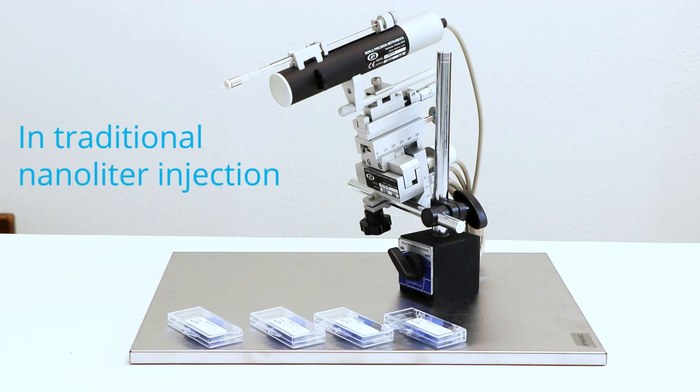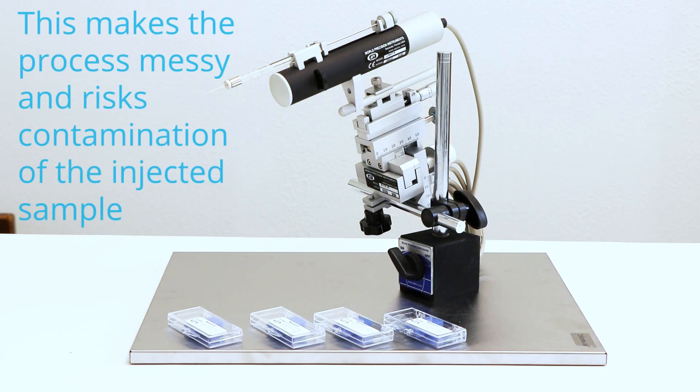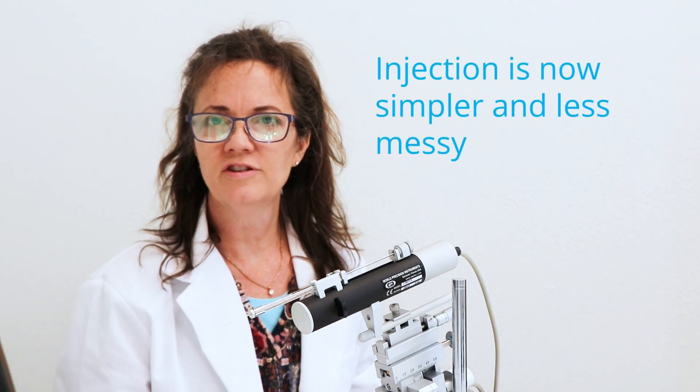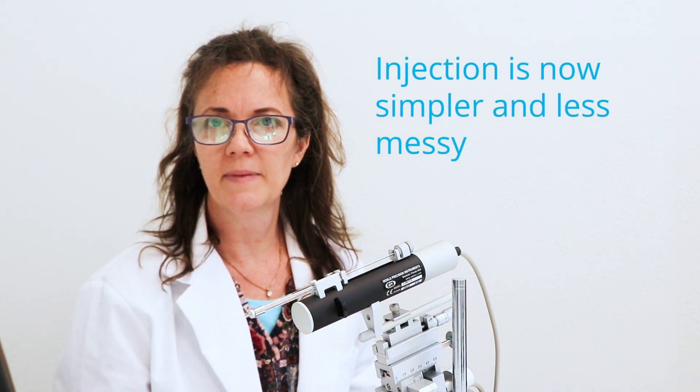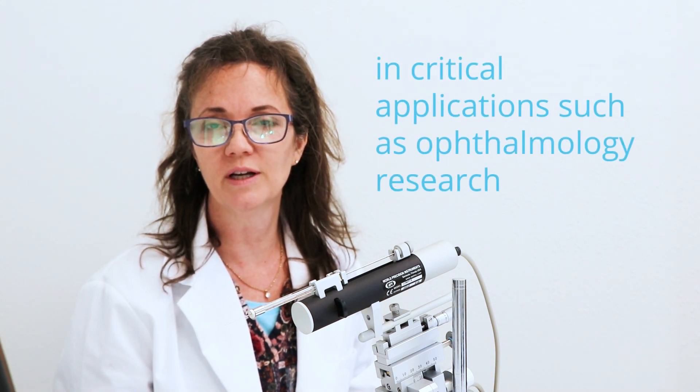In traditional nanoliter injection, the dead volume of the syringe and the needle is backfilled with oil as a transfer medium. This makes the process messy and risks contamination of the injected sample. Nanofil's low volume eliminates the need for oil, making injection simpler and less messy, with no possibility of oil contamination in critical applications.